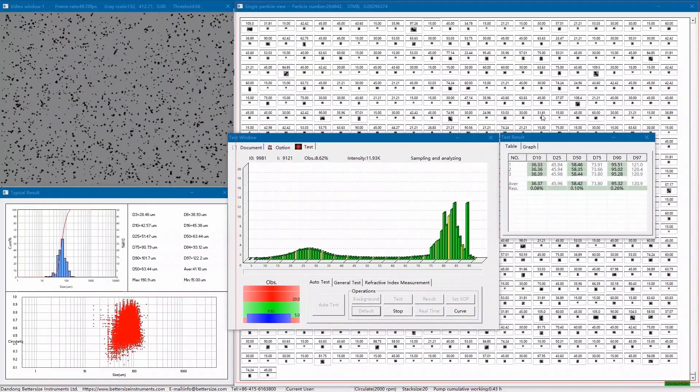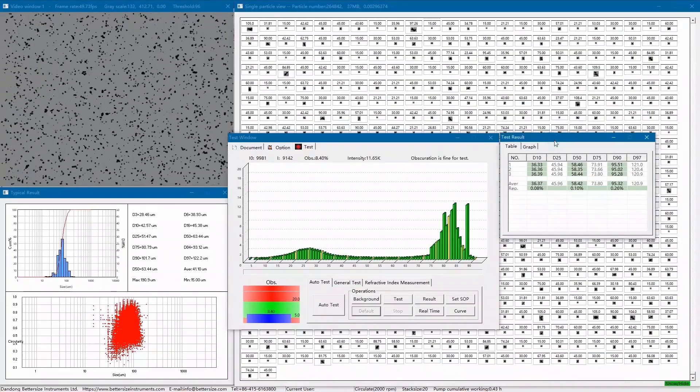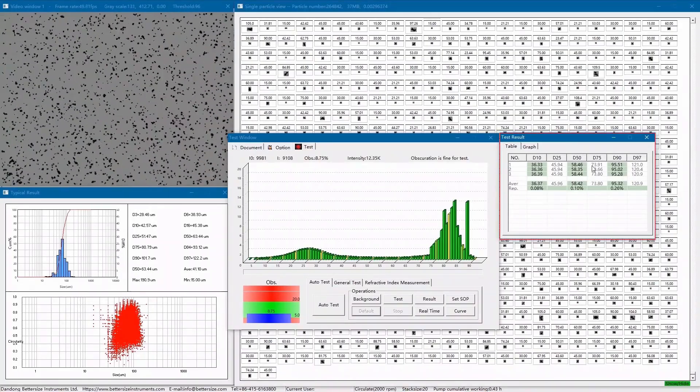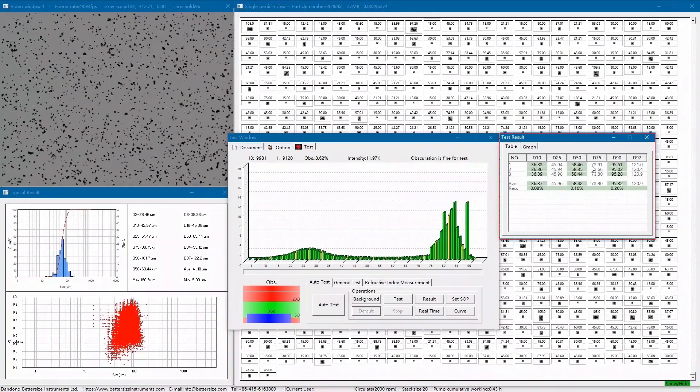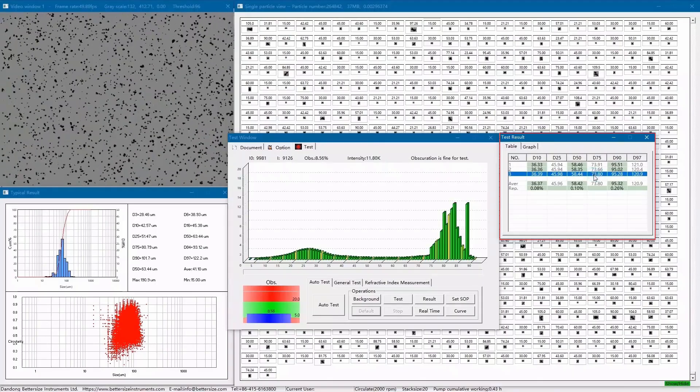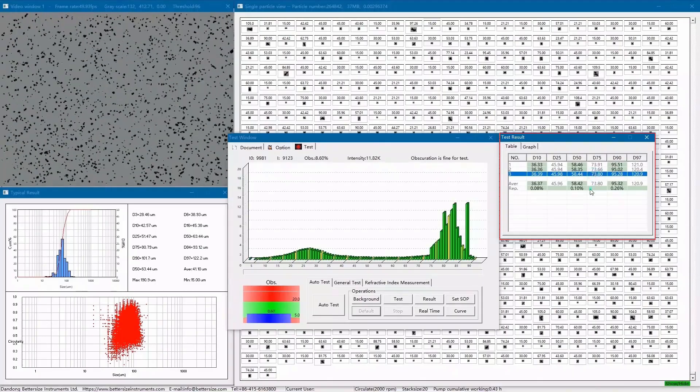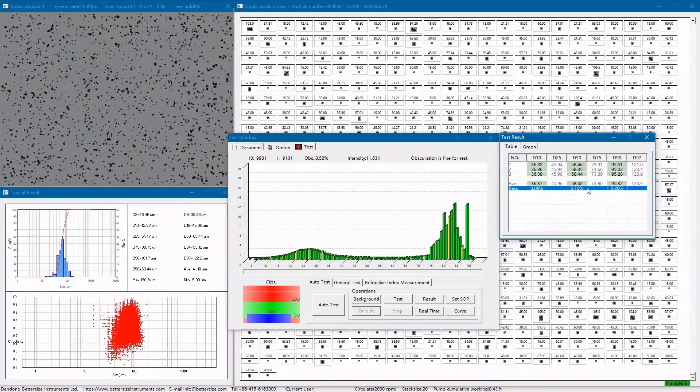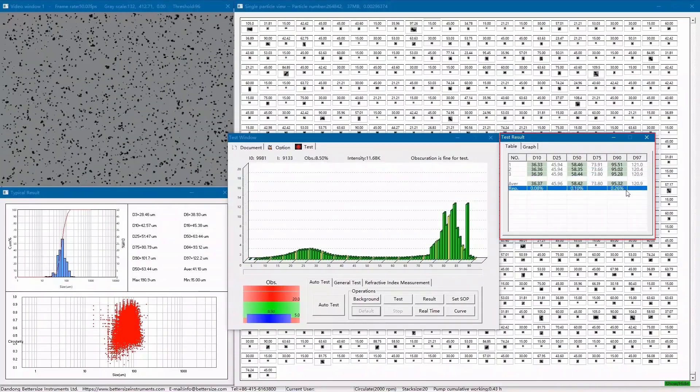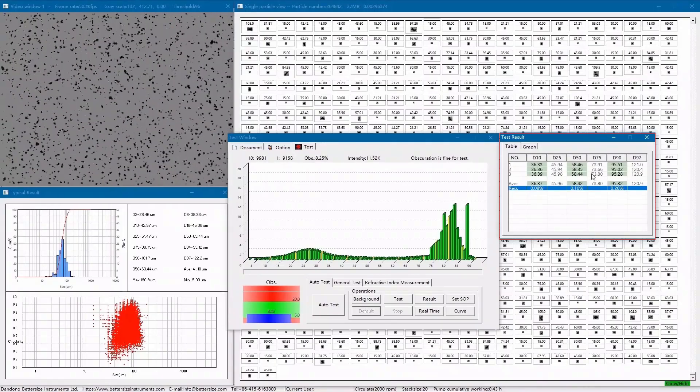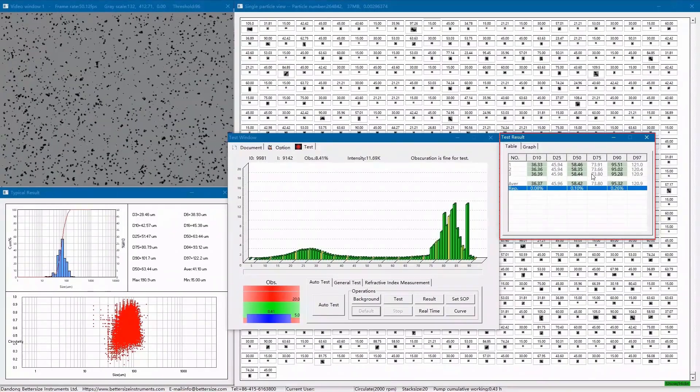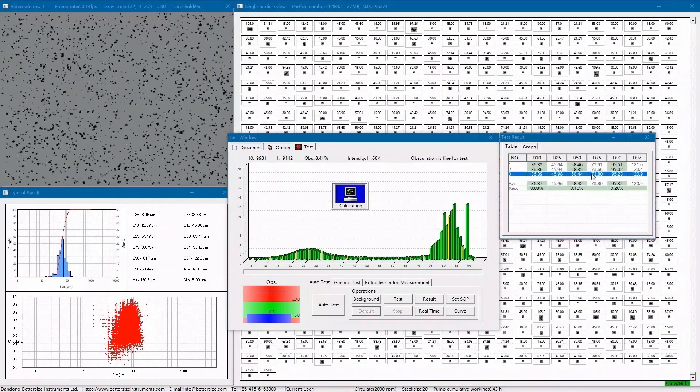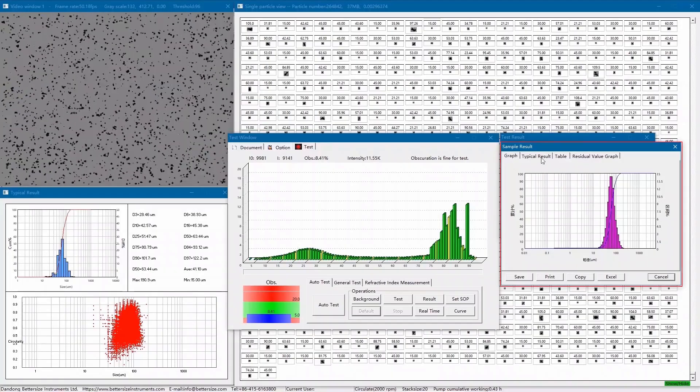Within a short time, three measurements are finished. It can be seen that the deviation of three results is very small, and the repeatability meets the ISO standard, indicating the results are stable. And we can also double-click on any result, and its detail parameter will pop up.